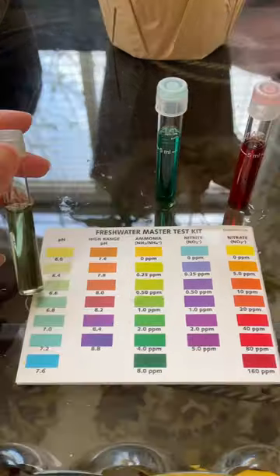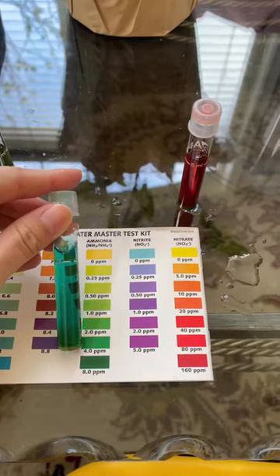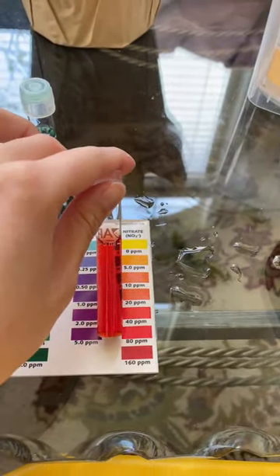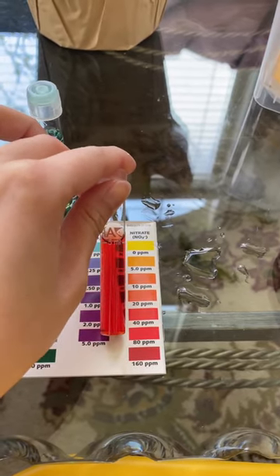And here are the final results. pH was not that great but not bad. Ammonia was terrible. And nitrates — don't get me started with the nitrates. I couldn't even tell — it could have been 80, 160, in between. It was just bad.